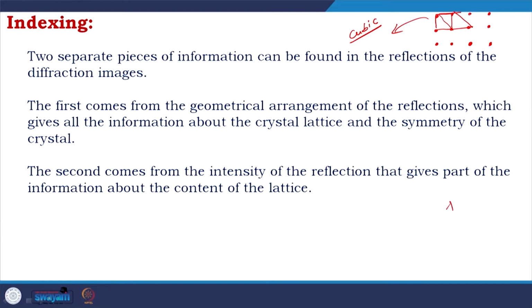But then there is a trick. Suppose I chose unit cell A and you choose unit cell B. You get lower symmetry and I got higher. Then I have to do less work than you. So, that is why there also needs to be optimization of choosing the unit cell. That is important.